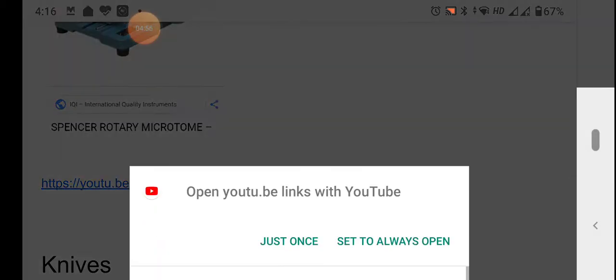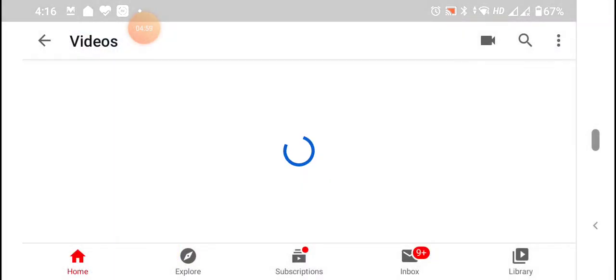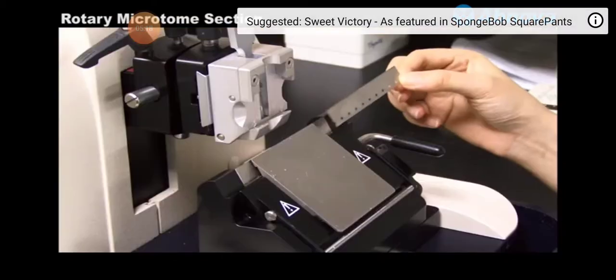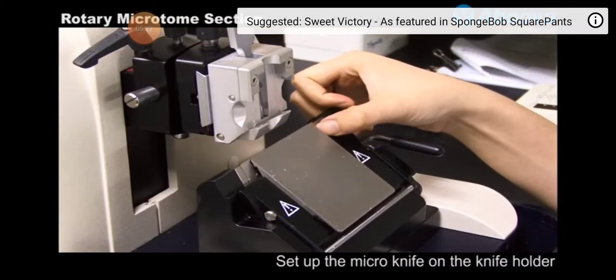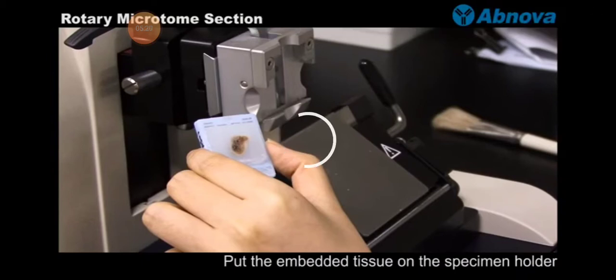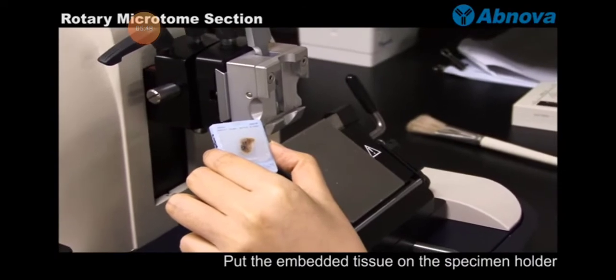I'll show you the working. You can see here the wax with the specimen at the middle, that block of wax with the specimen at the middle.